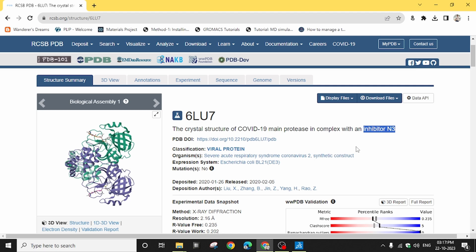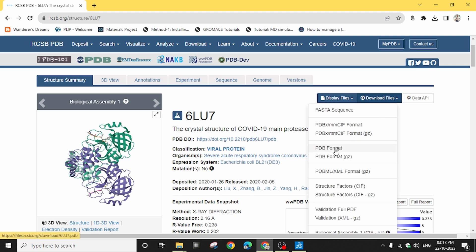Since this is a practically obtained model, you can't assure 100% similarity because the structure of inhibitor N3 and my ligand may differ, causing variations in the active site. Even if we get a good docking score, the ligand should bind to the active site of the enzyme to produce the desired biological effect. We need to verify whether our ligand has bound to the actual active site or how close the theoretical binding is. I'll download the PDB file to find where inhibitor N3 is bound.